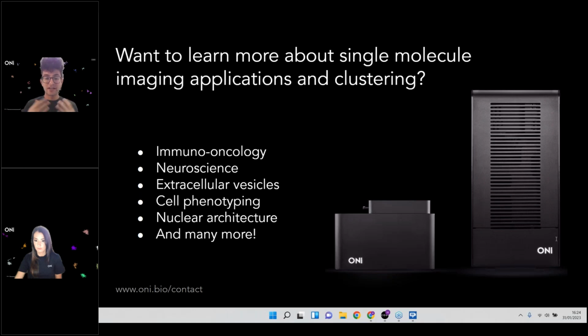Now, what that means is that you're effectively just doing filtering. And that's okay, that's also an interesting operation, but it's good to have these two things separate in your mind so you don't get down the wrong rabbit hole. But essentially, with HDB scan, you can apply constraints to get clusters, and then you can filter it. But with DB scan, the only option really available is after you've done your DB scan, you can filter the clusters. And that is also possible on our platform. So if you want to do that, you say, okay, I've done my DB scan, and now I want to get rid of certain clusters that don't meet my criteria. That is also okay. It's just a filtering operation, not a constraining operation.